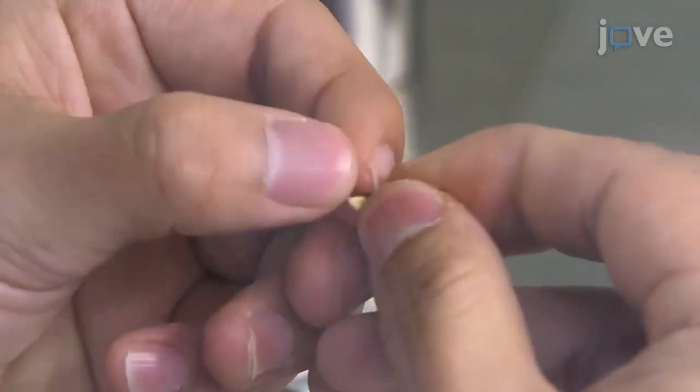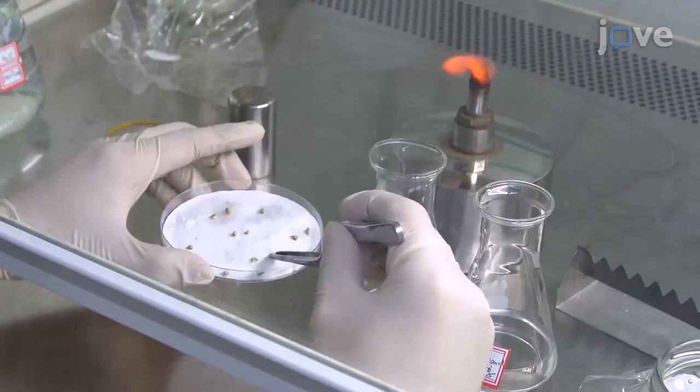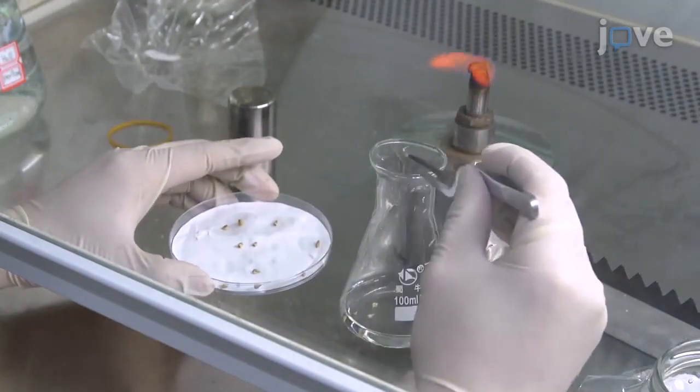When the seed coat can be easily removed, place 100 to 200 peeled seeds into a sterilized 100 milliliter conical flask containing 75% ethanol for 30 seconds.